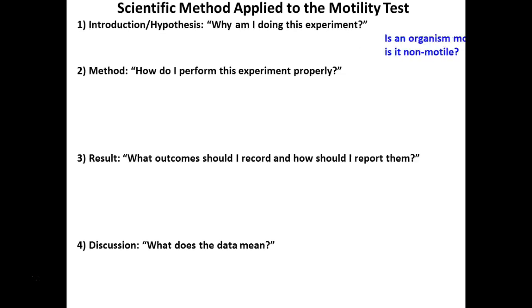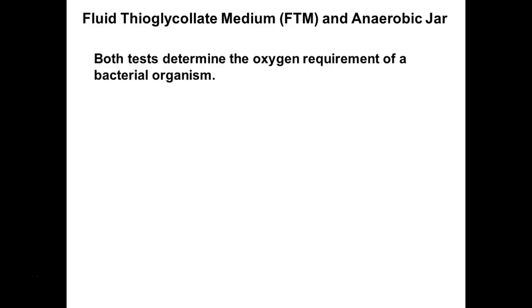Okay, so that's motility, and we've already recorded our results for it. Now FTM and anaerobic jar. Both tests, right, determine oxygen requirements of the bacteria.